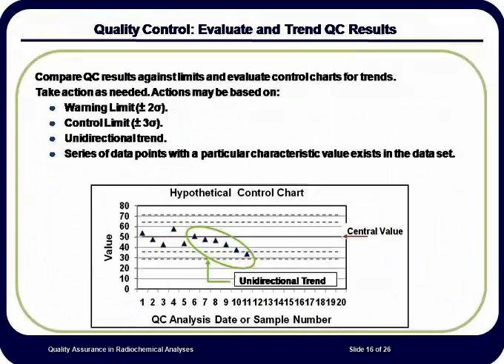Every quality control value that is plotted should be viewed not only in terms of being within the control limits, but also to see if the method is producing results in a normally distributed fashion. The control chart seen on this slide is indicating that the last 7 successive data points are trending in one direction. This is not a normally distributed pattern of results. Although all the points are within the control limits, this trend is worthy of an investigation as to its cause.